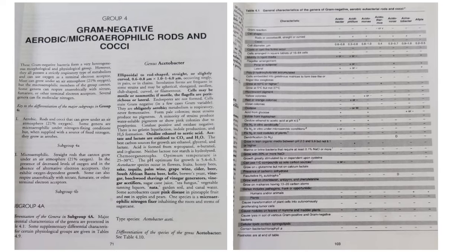Now let's take one example here. Suppose we have a culture which is gram negative rods, and it is aerobic because I have incubated it in an incubator under aerobic conditions, so it is growing well, nice, flourishing. I have that culture and now I have to identify it. So how to proceed? I have isolated it, done my colony characteristics, and done gram staining, and the result is gram negative. I have done the motility and it is motile. Suppose it is motile and rod shaped. So this is my first report of colony characteristics, which is ready.